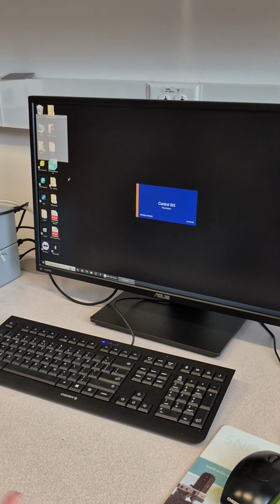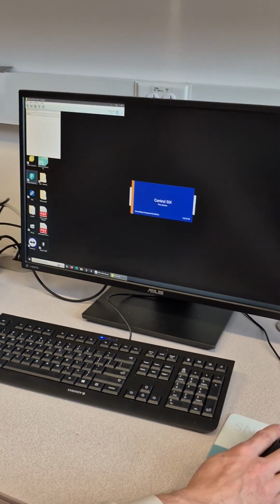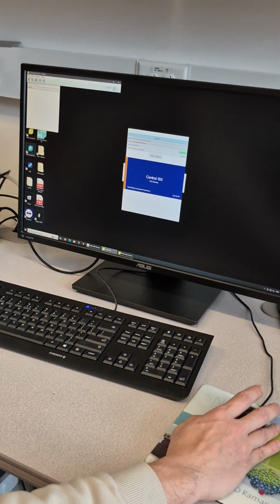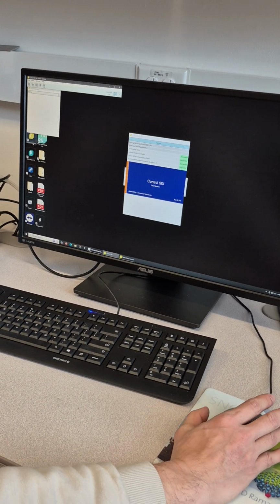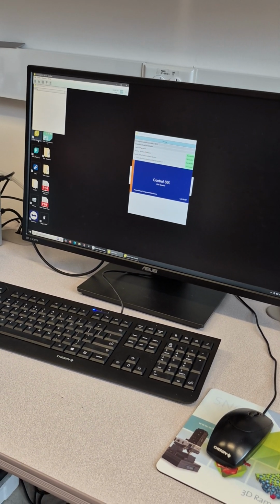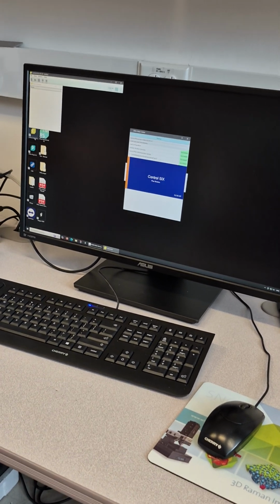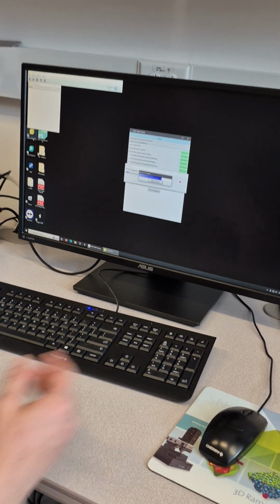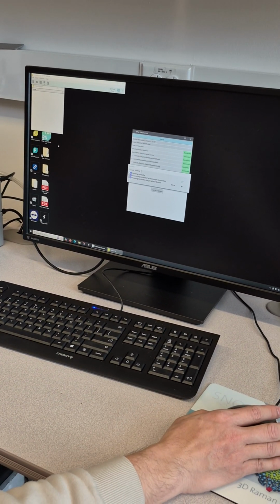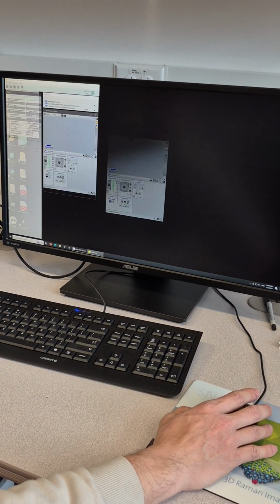It contains 5 or 6 windows. One of the windows is project 6. So you can run project 6 alone for just the data processing. If you start the user interface by starting control 6, it also brings up project 6, so you can collect data. Once you finish, you can go to project 6 to process the data. Then you can go back to collect, process, collect, process. It opens a few windows, it also checks to see everything is good, and it will show up. I'll show you once it's fully up.